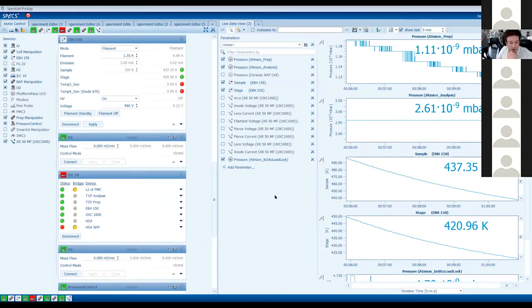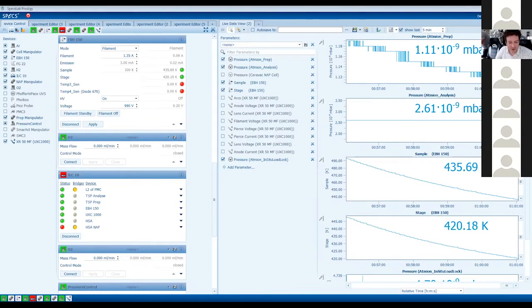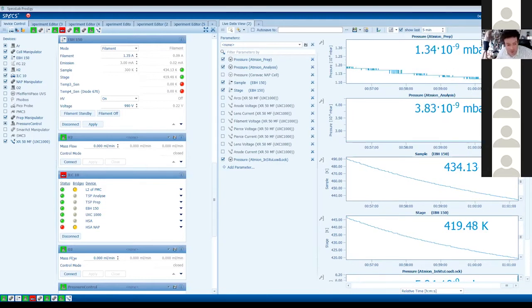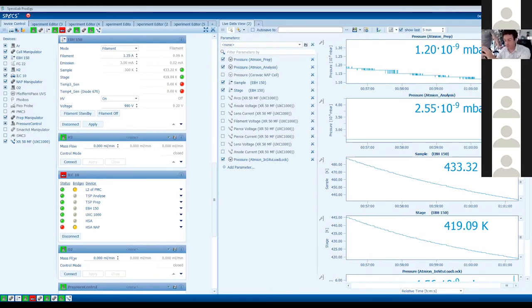Okay, with this camera, I noticed right now there was... so I want to show you something, and because it takes about 3-4 minutes, I can answer the questions I noticed in the chat. So now we have the sample in the preparation chamber. So we have several vacuum chambers connected together. There is load lock, in situ, and so on.